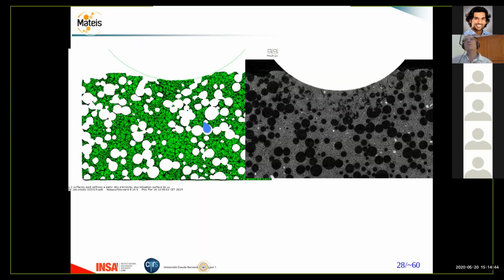Well, thank you. Very good question. The size limitation is related to the transmission of the X-rays. So if your sample is very absorbent, you cannot use a very big sample, because all the X-rays are going to be absorbed inside your sample, and there will be no X-rays outside your sample.